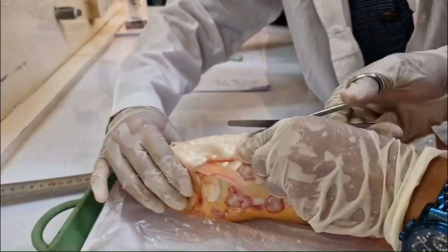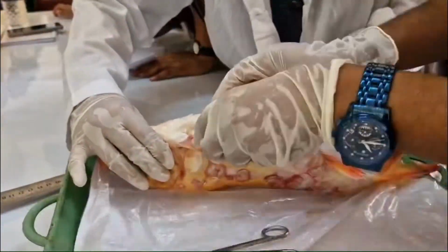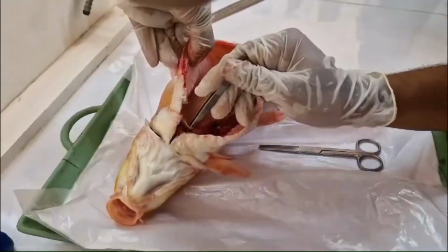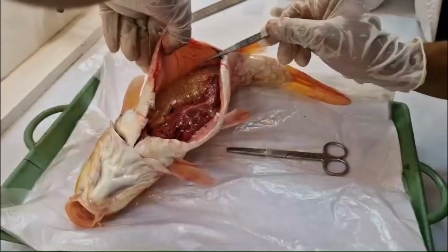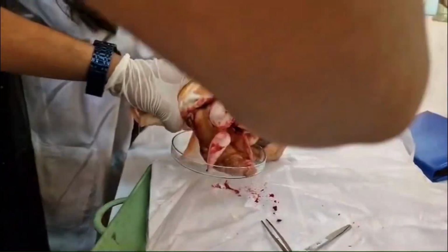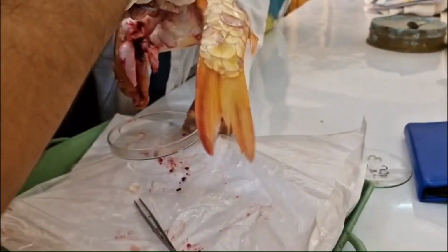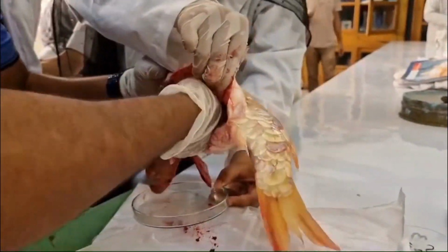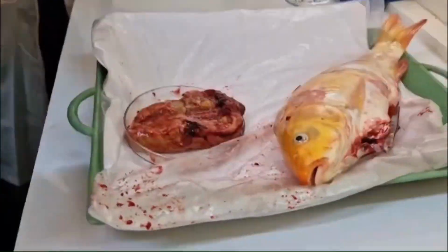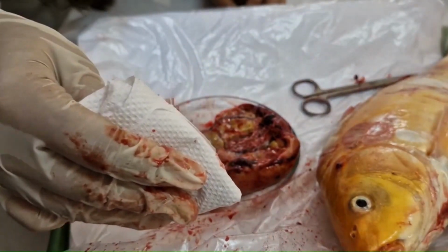After that, we faced up the ventral side and carefully cut the ventral region from the genital bore to near the operculum side. Then we collected the gonad from the fish and removed its offal. We cleaned the gonad with blotting paper and removed the external membrane.